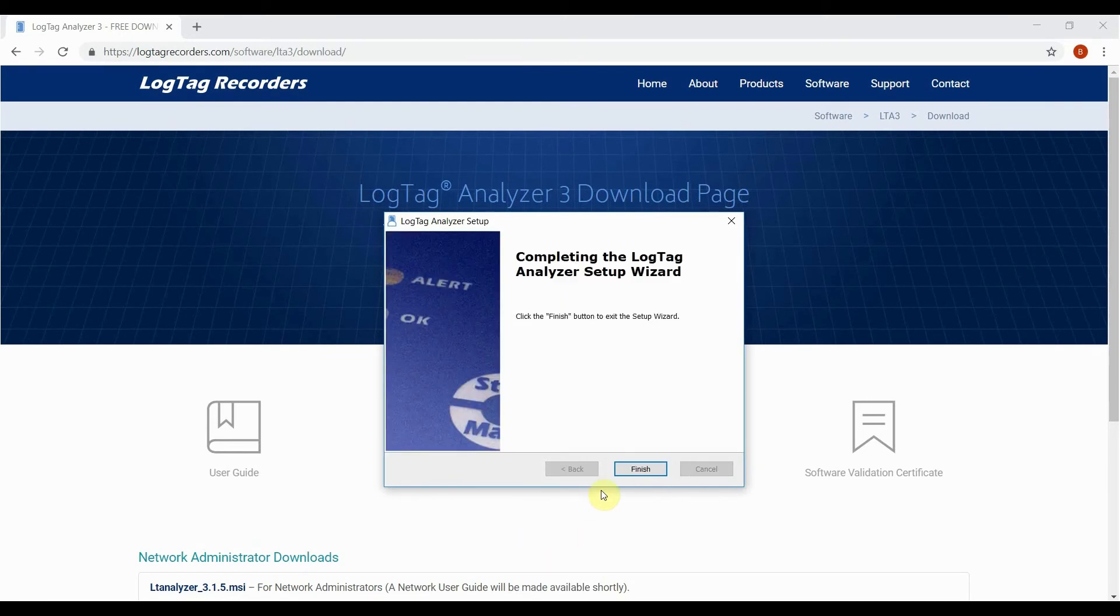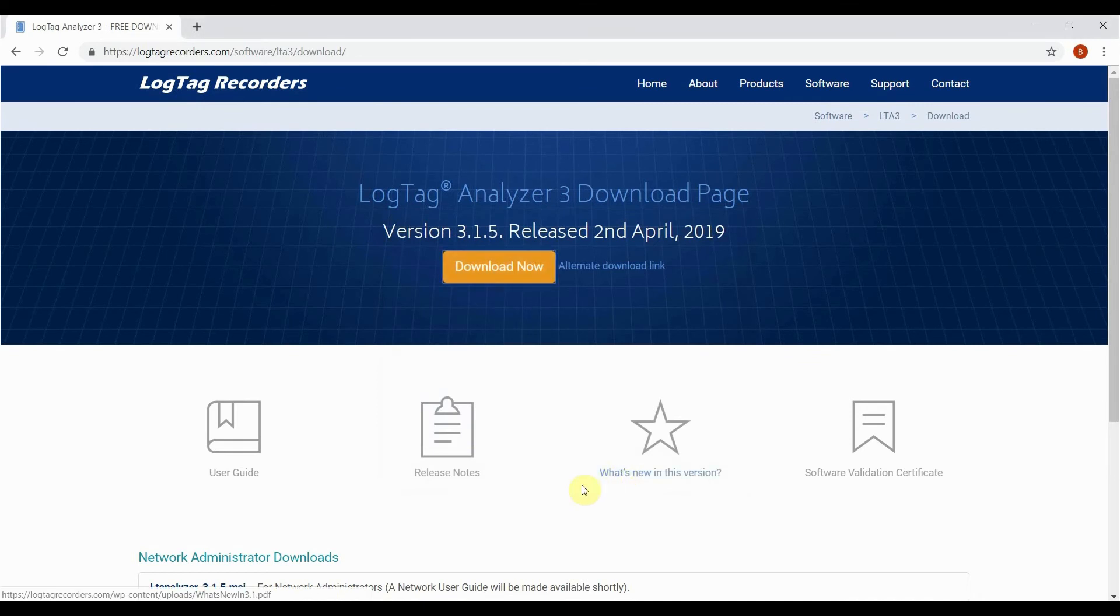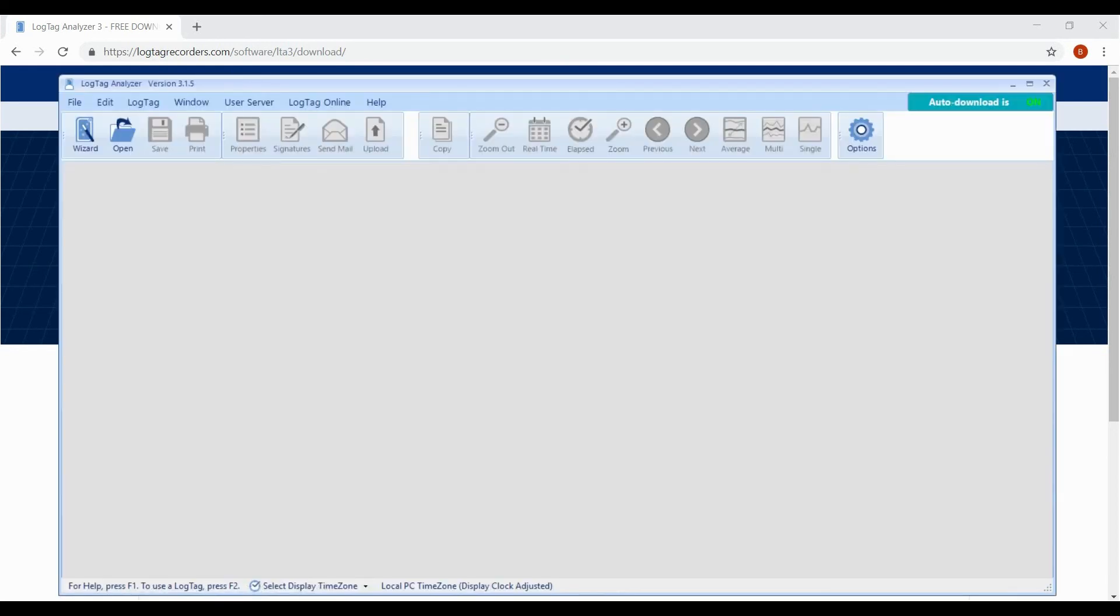Once installation has finished, click the finish button to close the setup wizard. Open the software by clicking on the shortcut on your desktop or from the start menu.